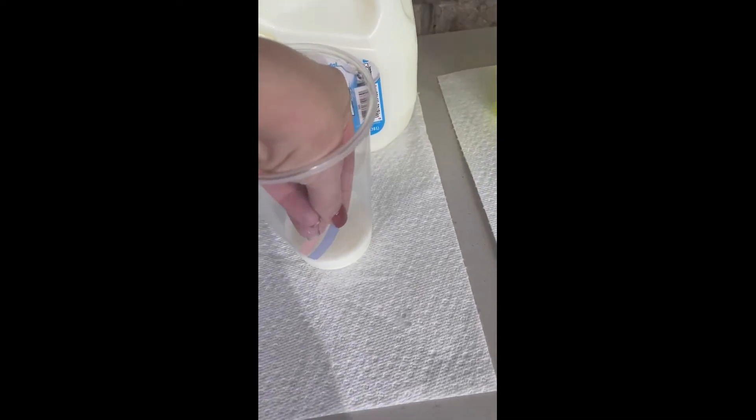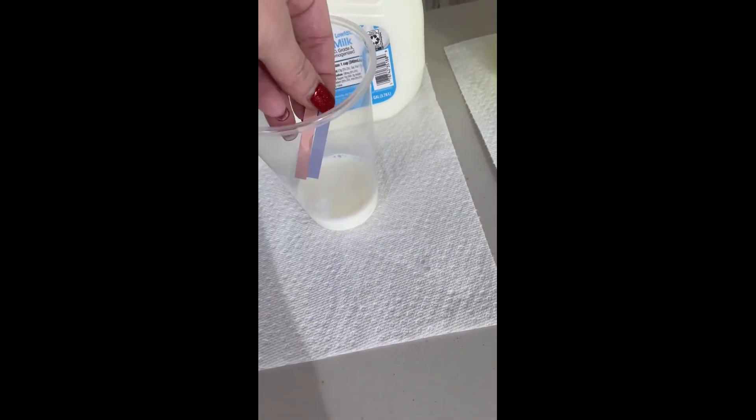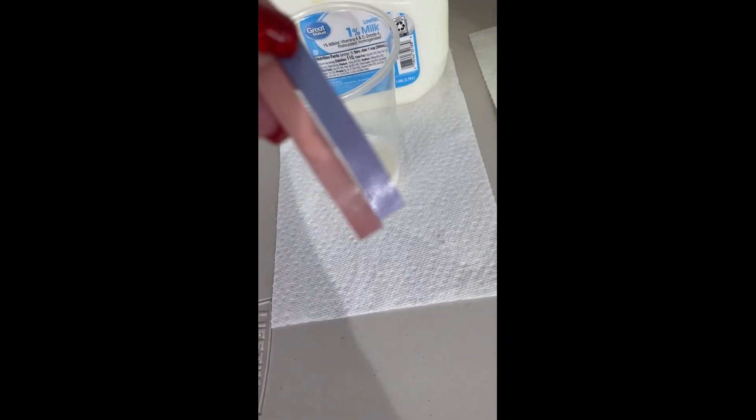Milk is our last one. Go ahead and dip it in and see if it turns colors. You can see that it doesn't really change the shade of color, meaning that it is very close to neutral, or pH 7.